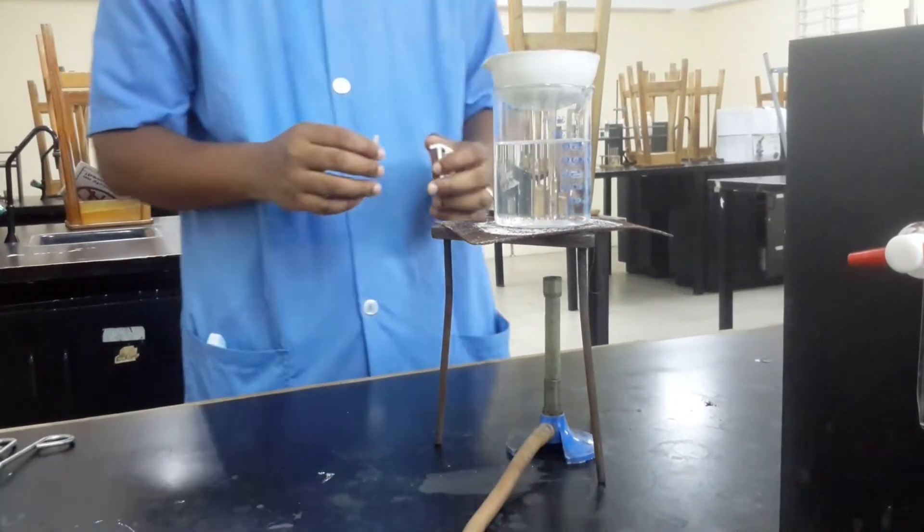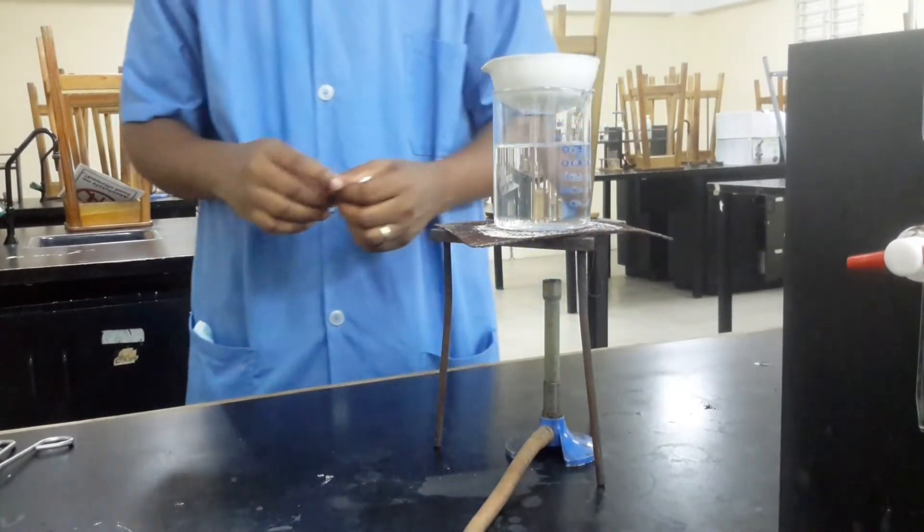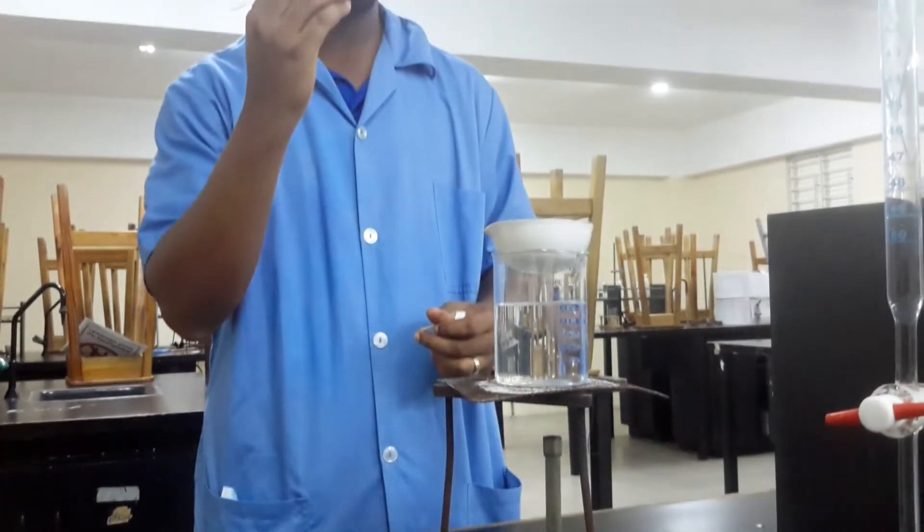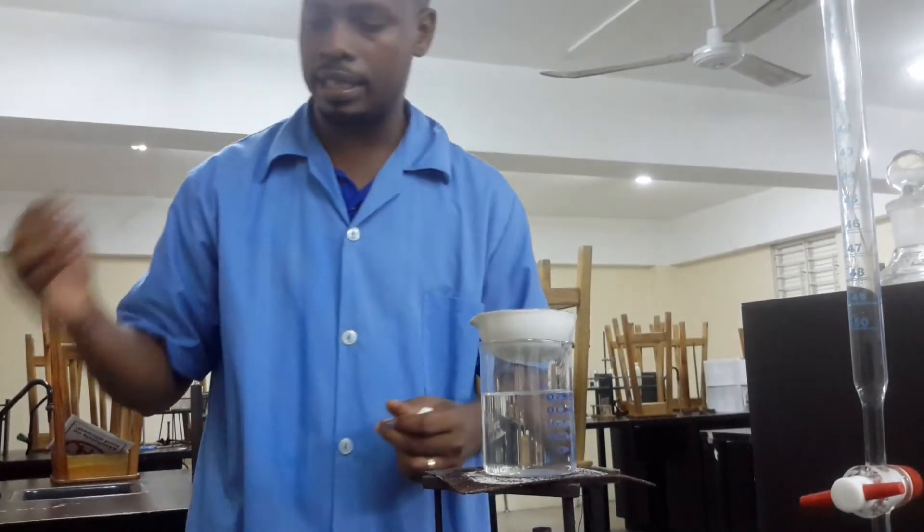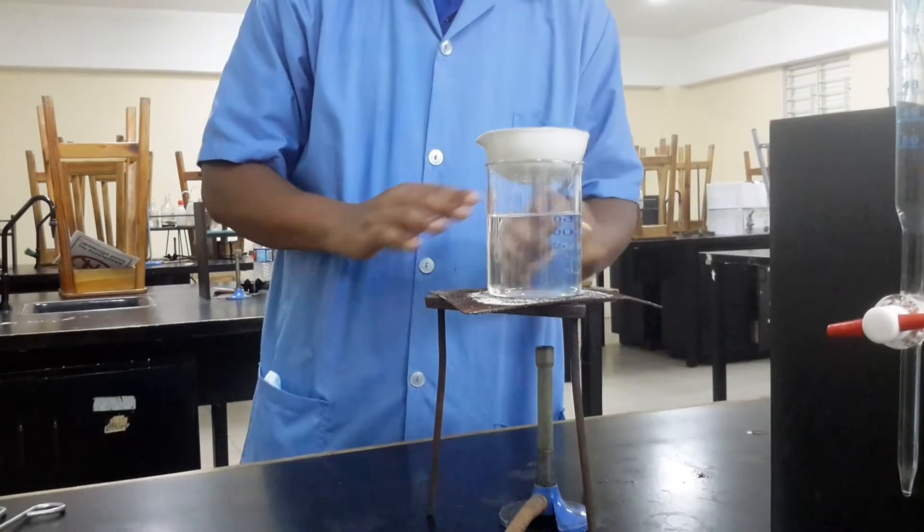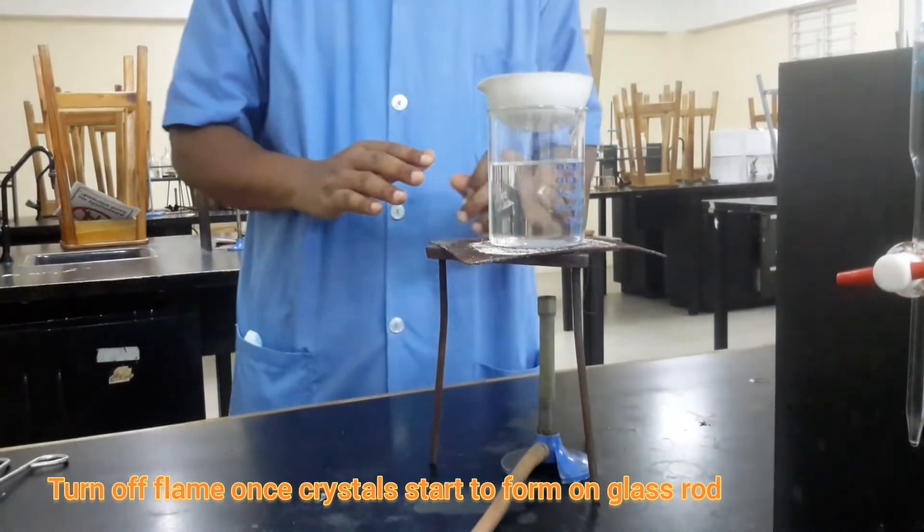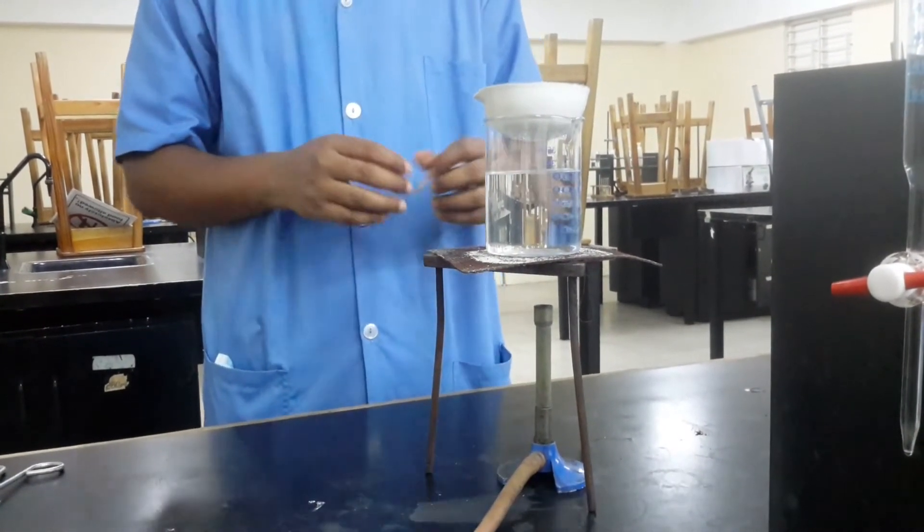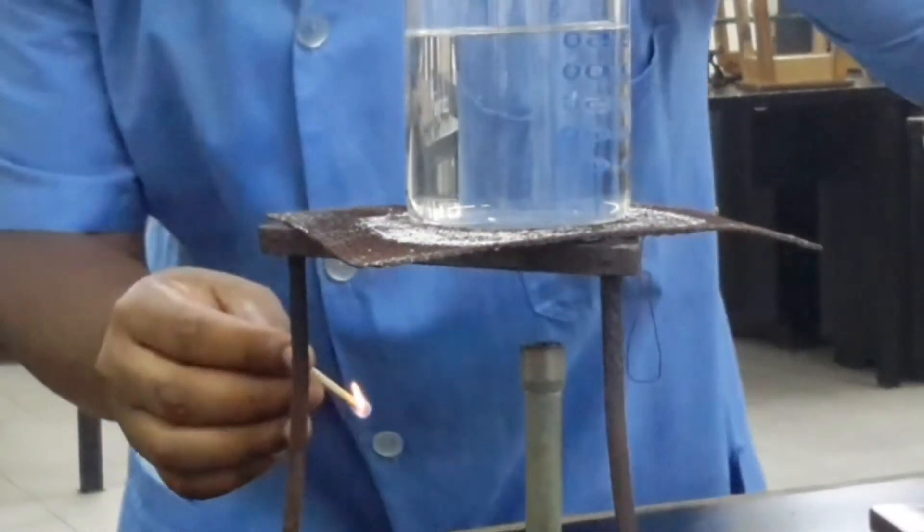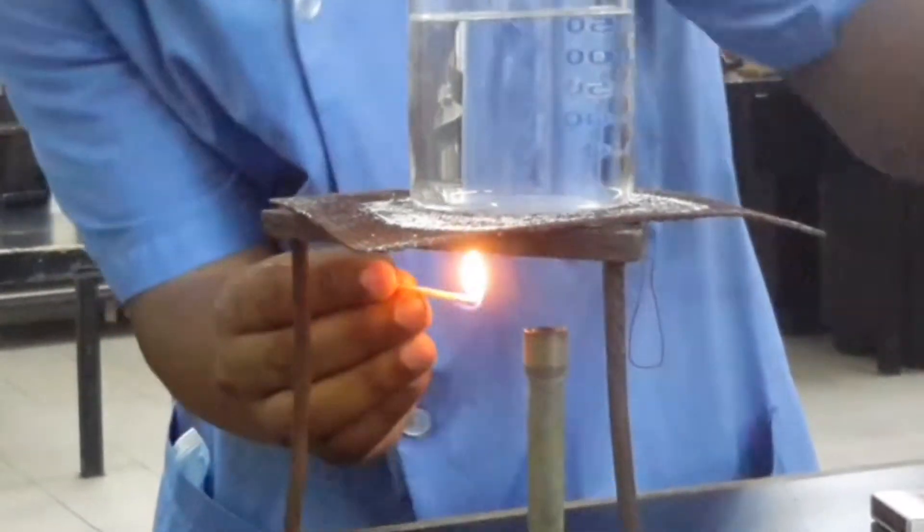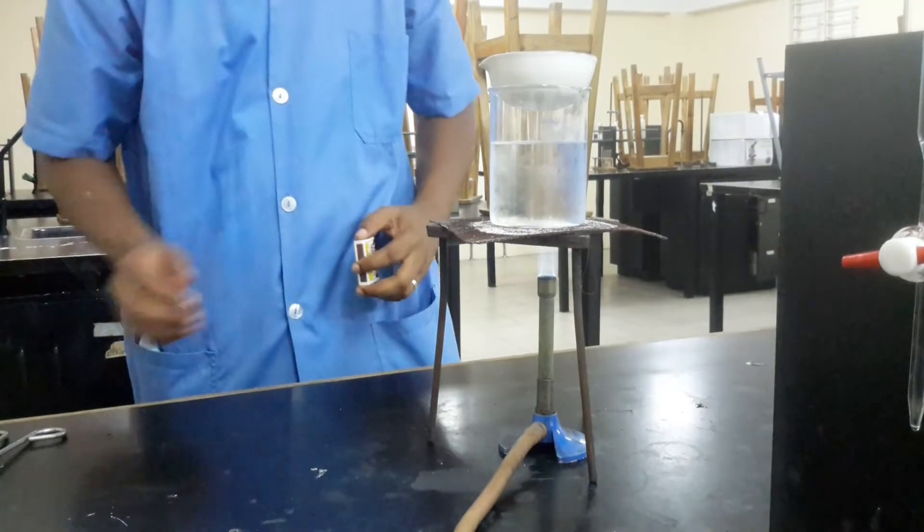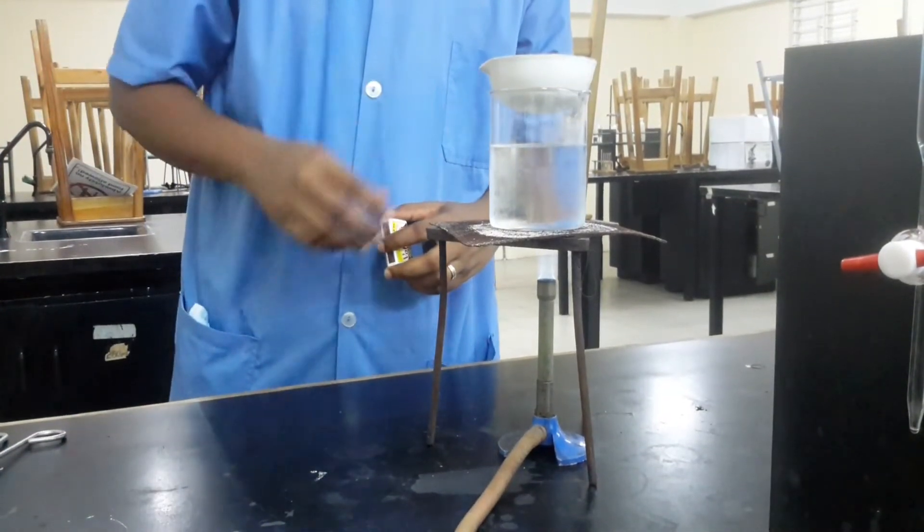We're going to be checking for crystallization along the way. We'll be using our glass rod, we'll be dipping our glass rod in it and let it come up when we take it up and look for crystallization. The moment we see crystallization, it means we can turn off the flame and we can just let it sit so the crystals can form. We'll just wait on the process.